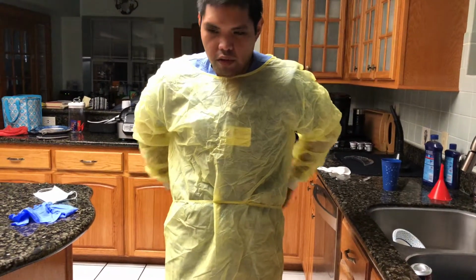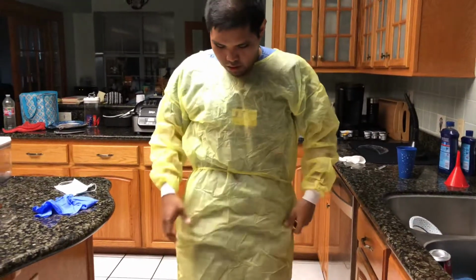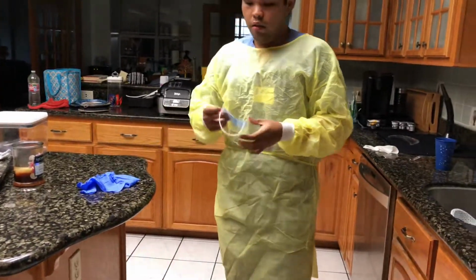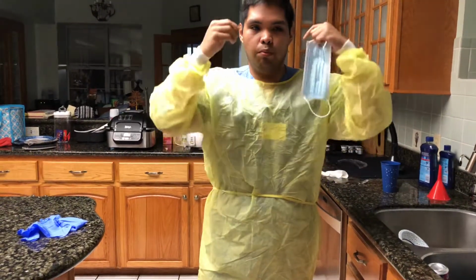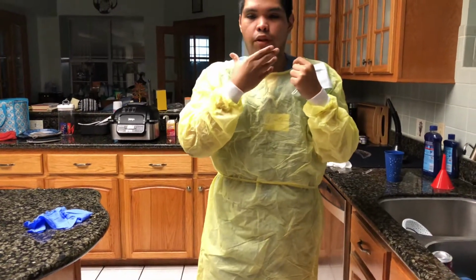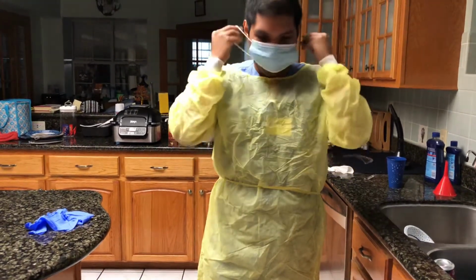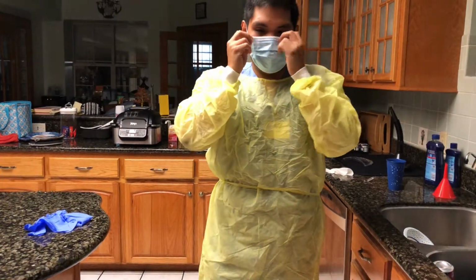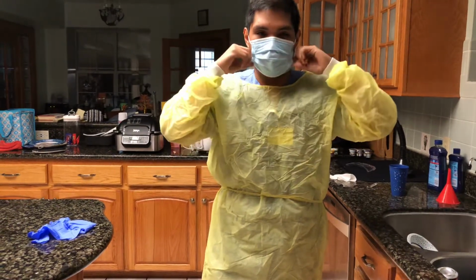Okay. So the gown is always the first thing that you need to put on. And like I said, make sure everything is covered in front. Alright, the next thing that we're gonna put on is your mask. Now most masks are gonna be tied. If it's a tied mask, you put the top one first, and then you make sure that your mouth and nose is covered firmly, and then you tie the bottom one. Right now I have these kinds of masks, so I'm gonna put it on. And like I said, you have to cover your whole mouth and chin and make sure that it's snug. You can pinch this little part to cover the nose and make sure that it's snug.